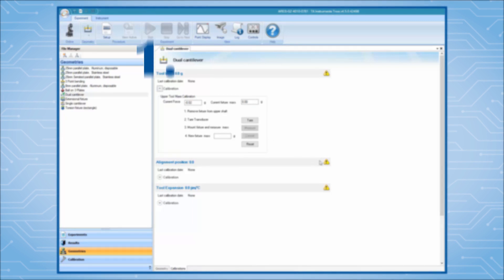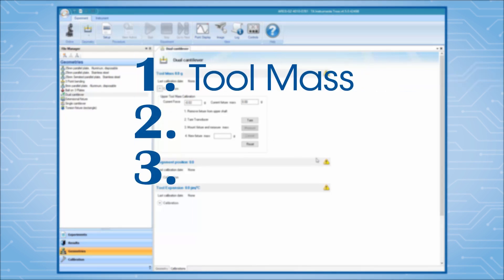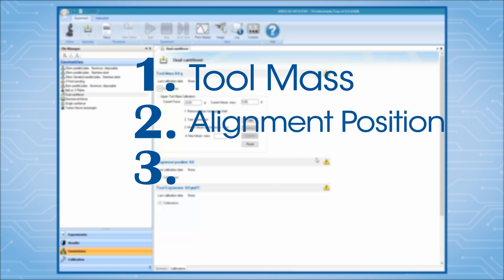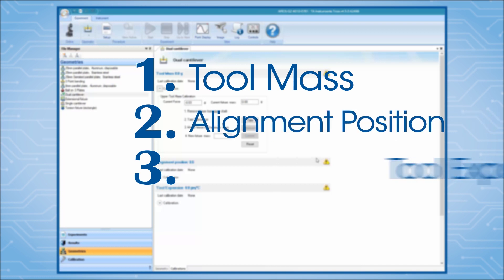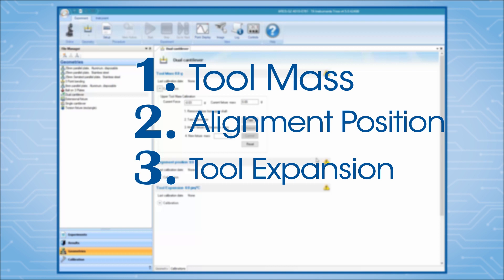The cantilever clamp calibration includes three steps: tool mass, alignment position, and tool expansion. The third step, tool thermal expansion calibration, is optional.